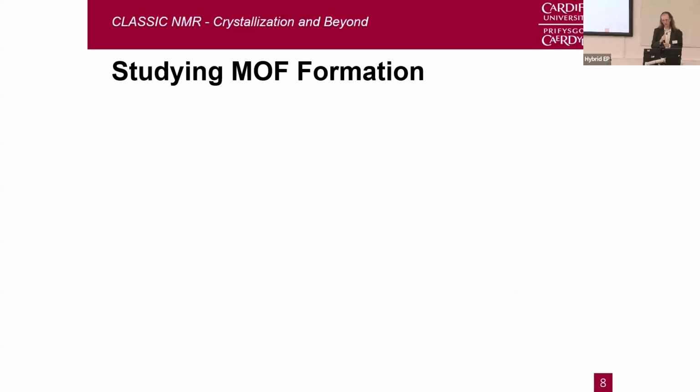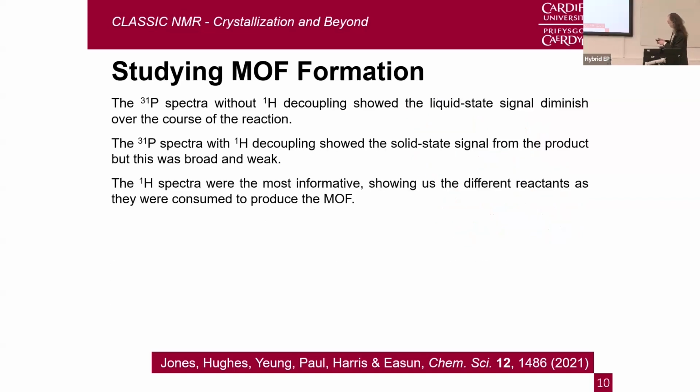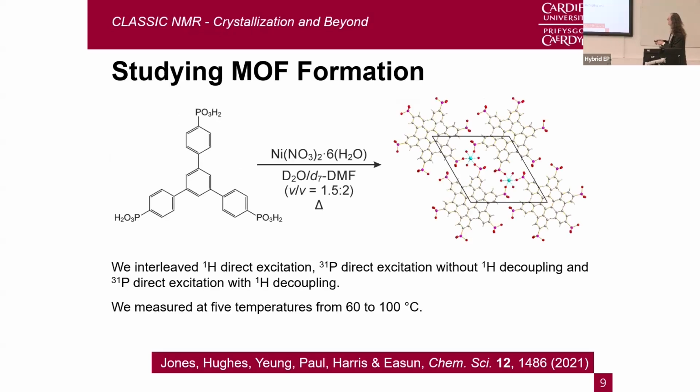So the first thing that I want to talk about today is, as I say, moving beyond crystallization, and this is looking at the formation of a metal organic framework, a MOF. This is the MOF that we're studying in collaboration with Tim Eason's group, who's now in Birmingham. We've got our linker molecule here. It reacts with nickel nitrate, there's the nickel there in the middle, and produces this MOF.